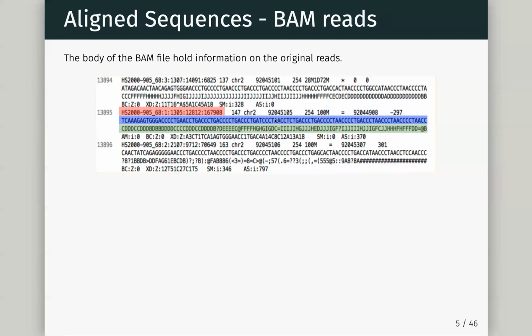So if we had a low quality score, and I think we checked this, the hash was a low quality score, the corresponding read is probably not very confident. We're not really sure that that C is a C at that position. We don't really care about that now, right? We've already aligned our data.